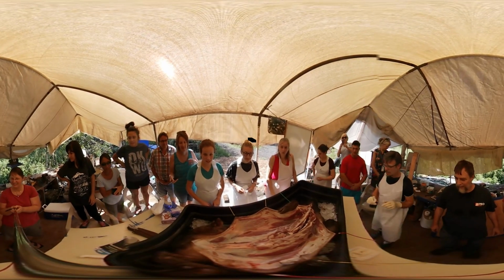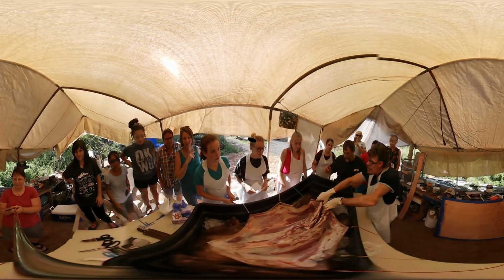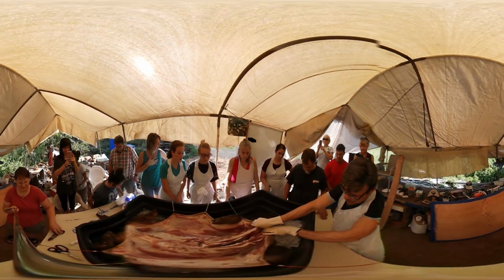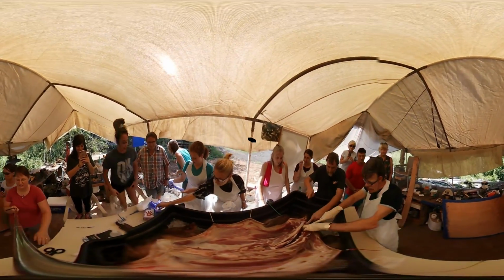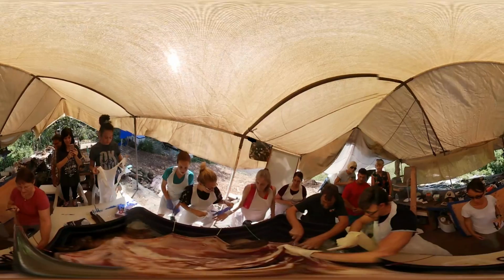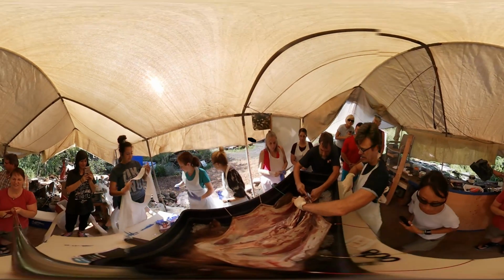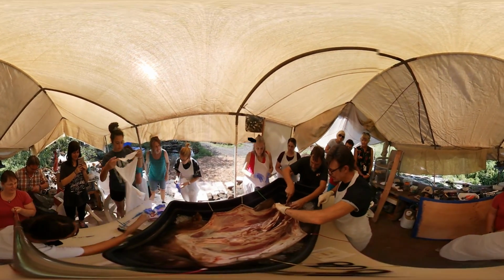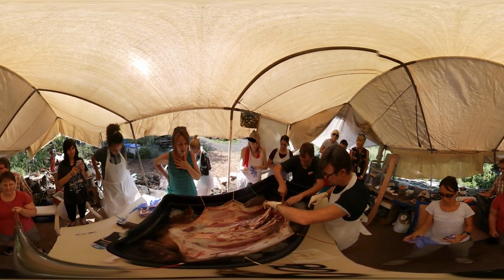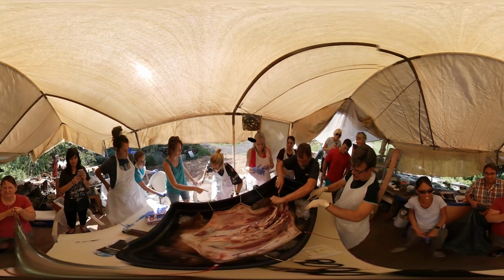Excellent, thank you. All right, so Tony just opened up the sternum. Who's closest here? We're going to start with the respiratory and the cardiovascular system. Let me open a little bit more. Scissors, thank you. You can see that trachea nicely, and there's the larynx. Andrew did better than what I would have done. I gave you everything; everything is totally intact. There's the trachea.